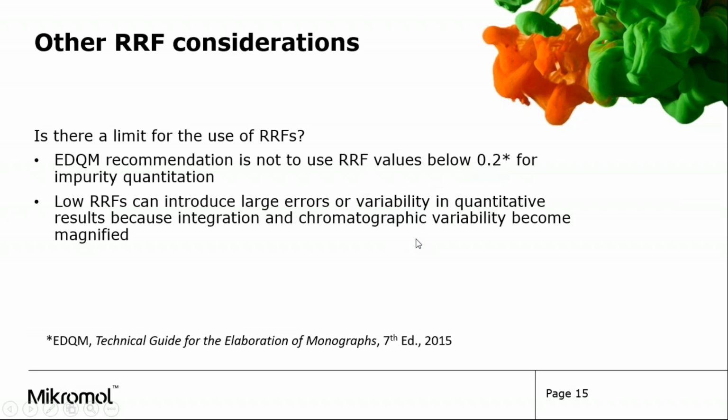So in cases like that where the response is quite low for the compound compared to the API, it's better to use an external standard of the impurity, or to go to a different wavelength where the response factors might be more similar.